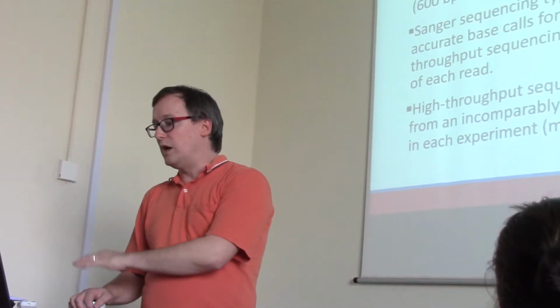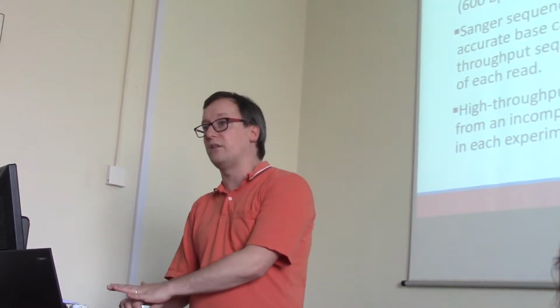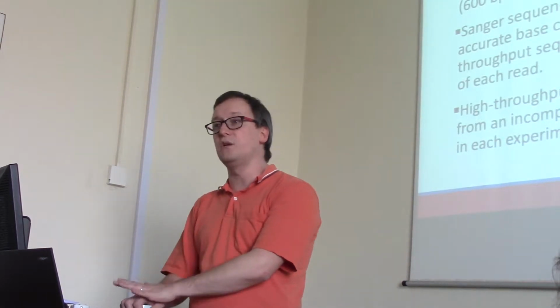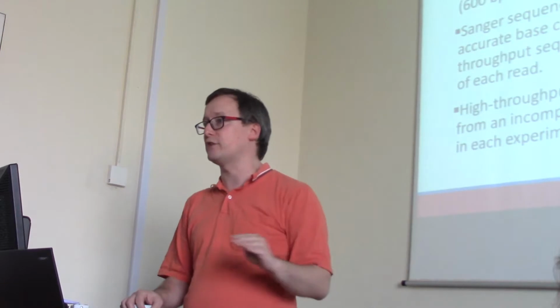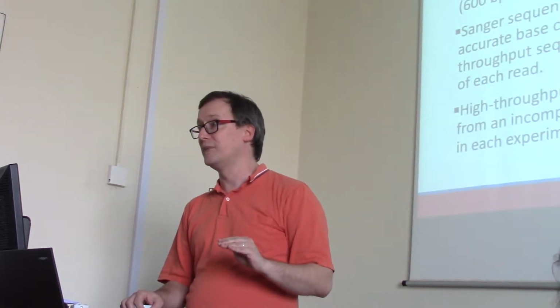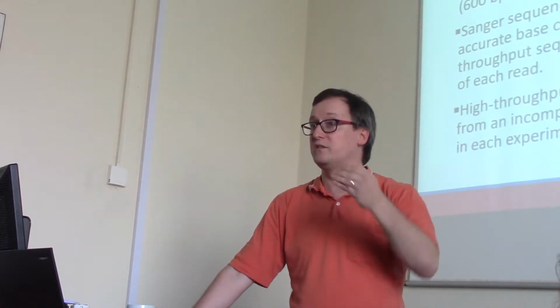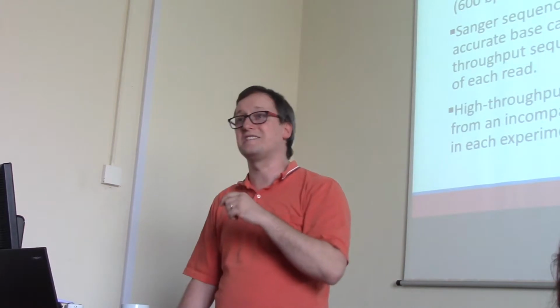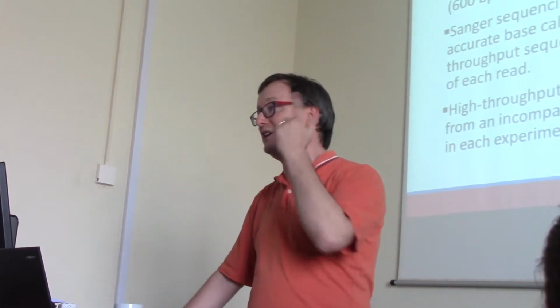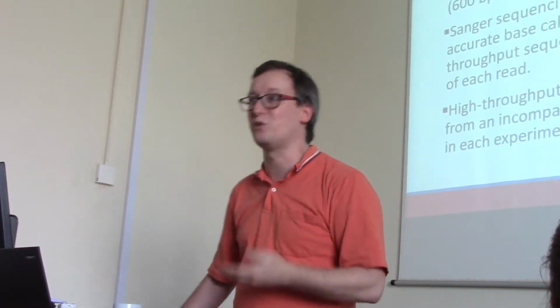Okay, so in the end, the chief advantage that we get from massively parallel sequencers is that they are sequencing an incomparably greater number of templates than any capillary electrophoresis instrument ever did. So our chief design aims with today's sequencers are about volume, not necessarily about length, not necessarily about the quality scores, but by just covering us in data, they help us to accomplish all of the goals that we have.